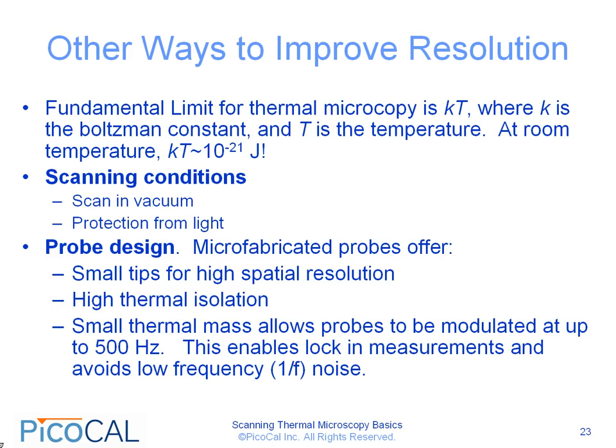In order to improve resolution, we can scan in vacuum conditions and we can protect from light. Scanning in vacuum reduces a lot of the parasitic heat flows which occur through the gas or through the liquid meniscus near the tip. And it also reduces a lot of the Brownian noise which may occur.